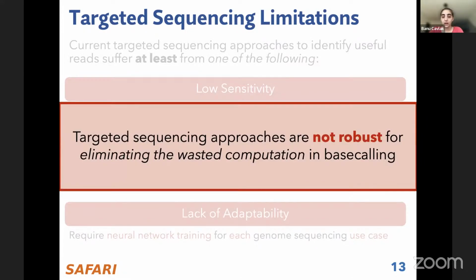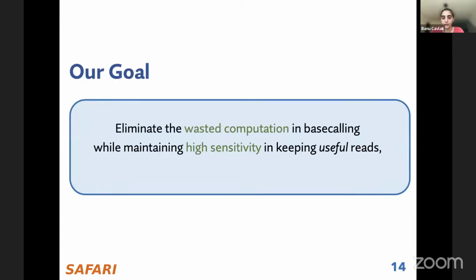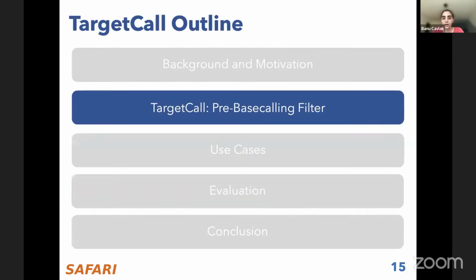That's why we say that these targeted sequencing methods, although they are useful for real-time analysis, are not robust approaches for eliminating the wasted computation in basecalling. Our goal in this work is to eliminate the wasted computation in basecalling, while maintaining high sensitivity in keeping useful reads, while being scalable to large reference genomes, and while maintaining adaptability to different use cases without requiring any further preprocessing steps.